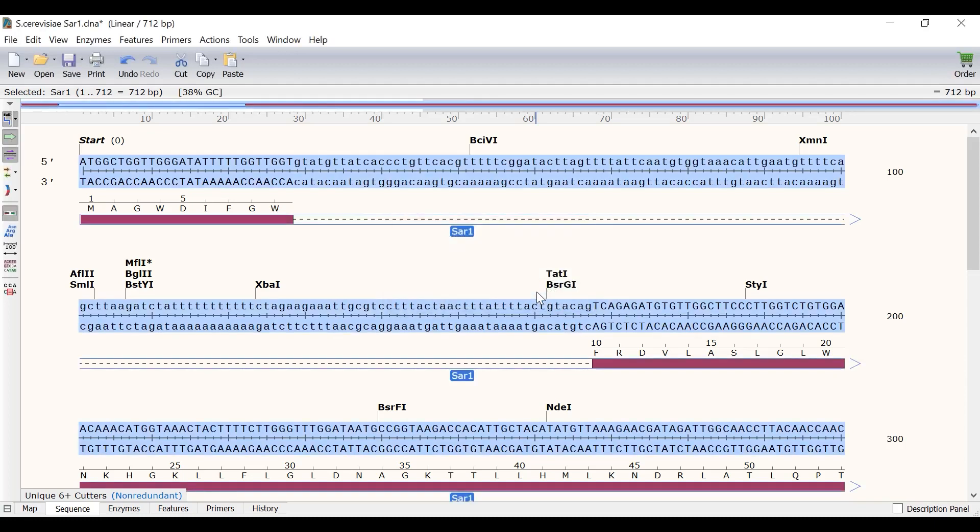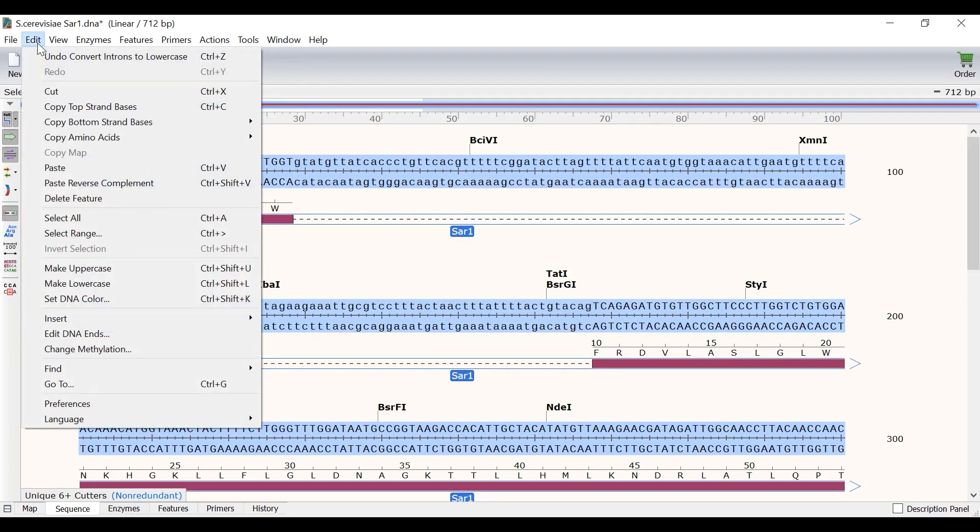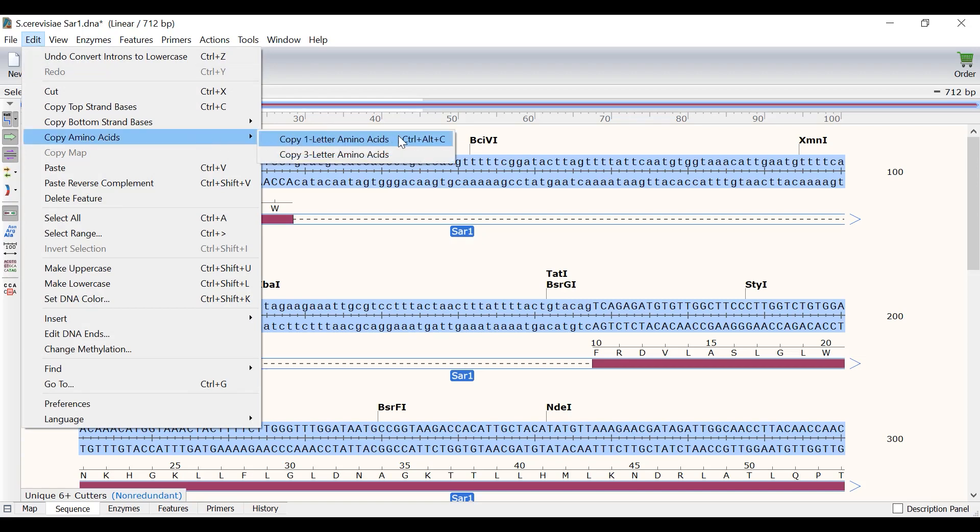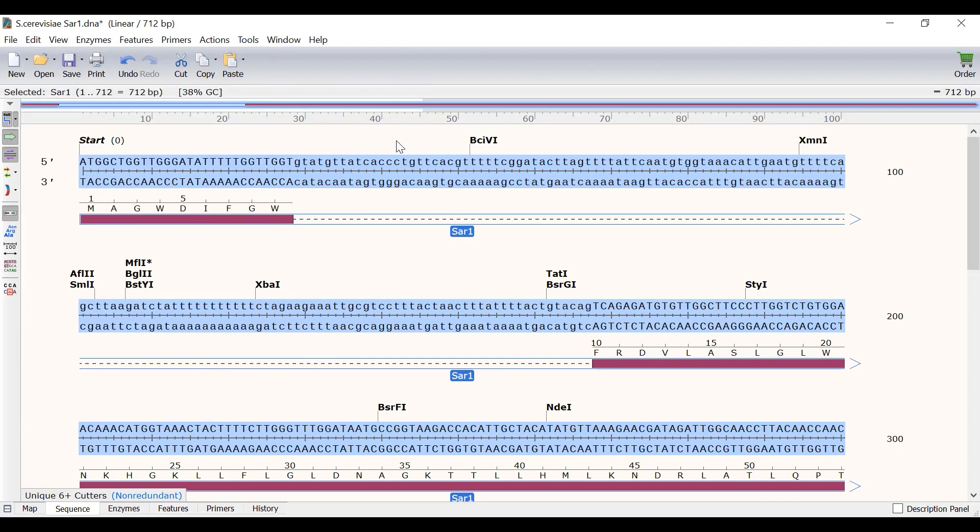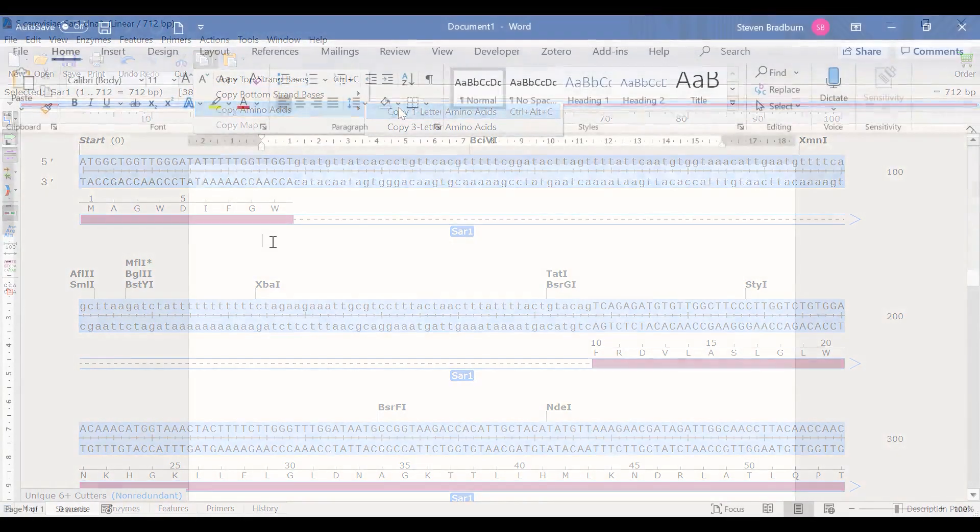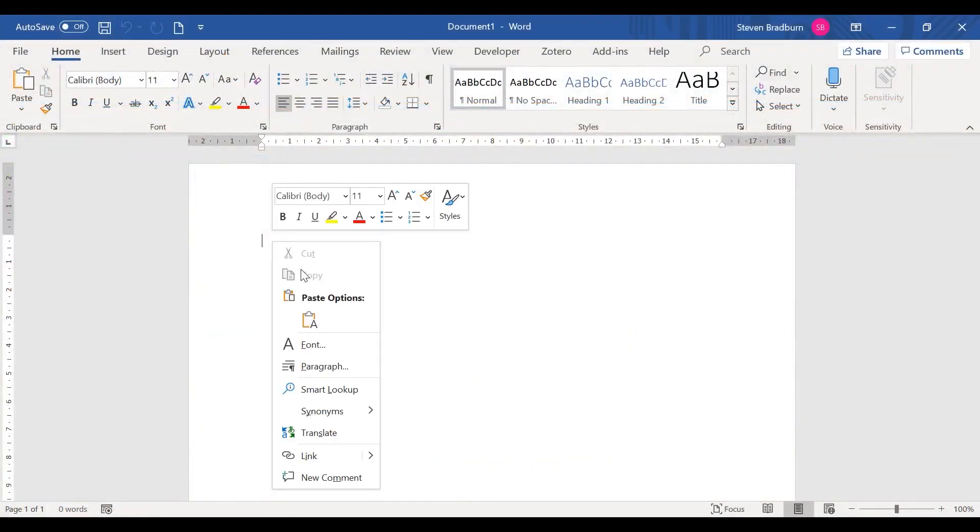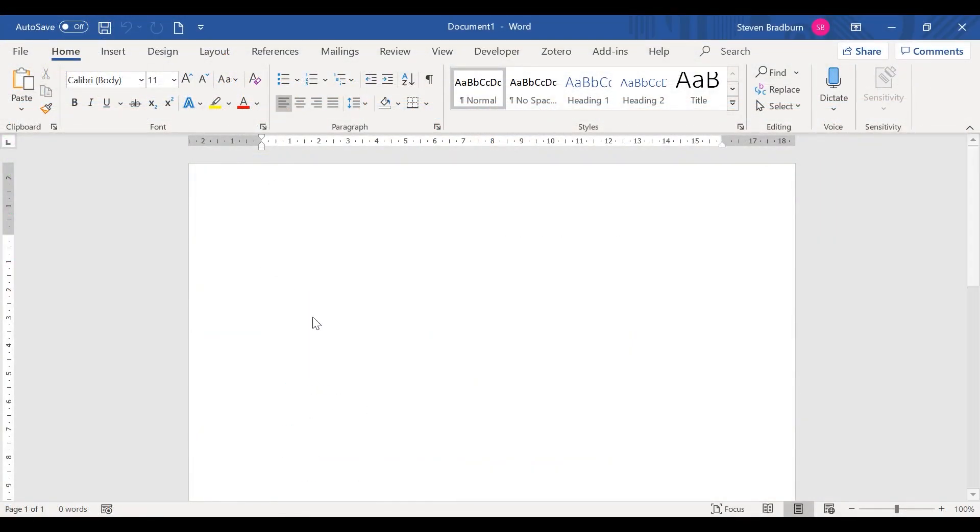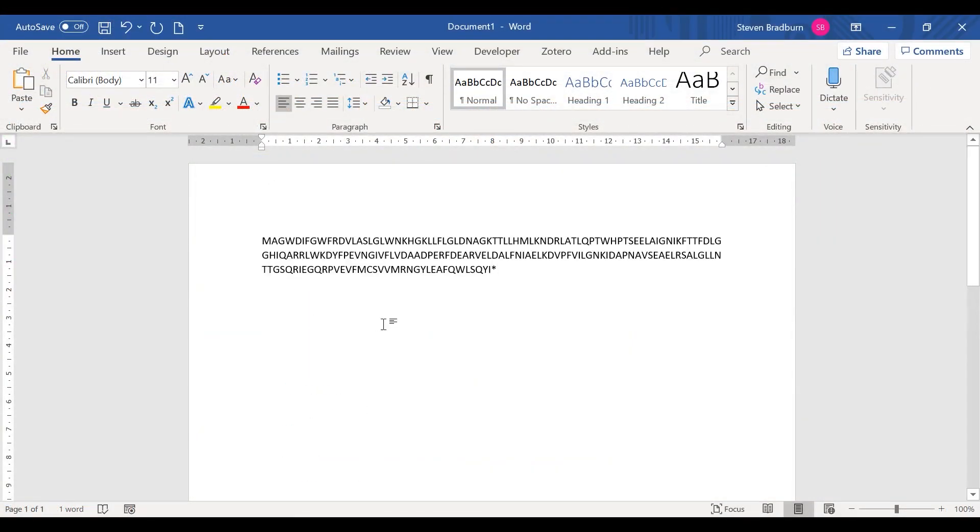And if you want to export the translated sequence, simply select the feature and go to edit, copy amino acids, and then select to copy either the 1 letter or 3 letter sequence. Alternatively you can use the copy button at the top as a shortcut for this. Then simply paste the sequence into the program of interest.